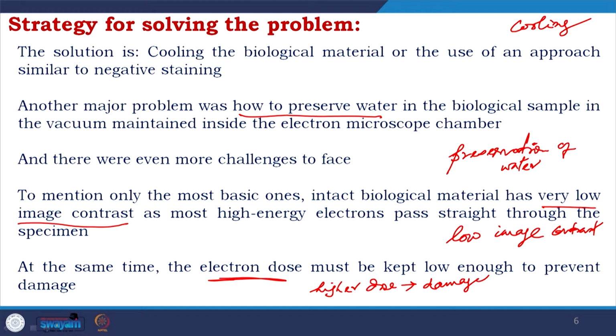Now, if you use a lower dose, the contrast or signal to noise is even worse.